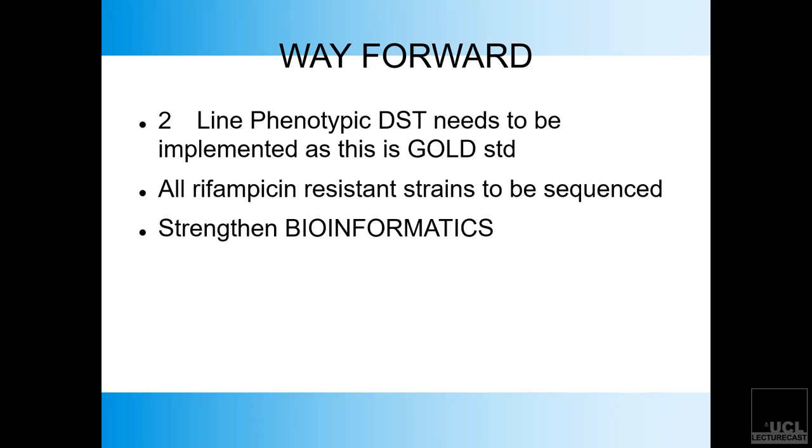So just the process up to getting to where you're using the sequencing kit was different, depending on the bug that you're starting from. And if you go on the Oxford Nanopore site, it has basically a flow diagram that takes you through. It asks what experiment you want to do, what organism you want to do, and it tells you, okay, buy this kit and this is what you need to do. So we can help you in that regard for other organisms.